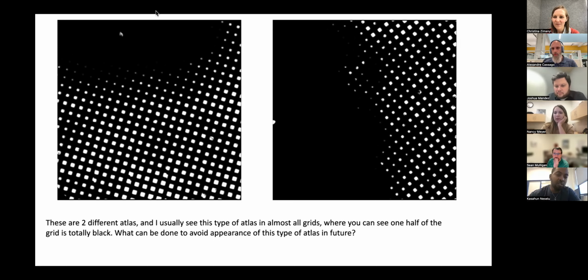Yeah, I also say this is a good atlas, especially when you have some sort of gradient where you have small to large squares. When you're doing your data collection, you can find where your particle is the happiest. There are times where you don't have a lot of particles on the bigger squares, so you may move down to medium-sized squares.